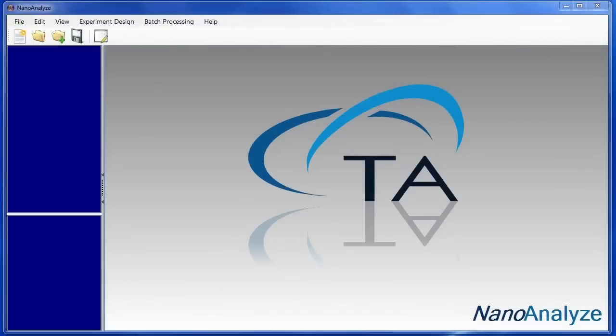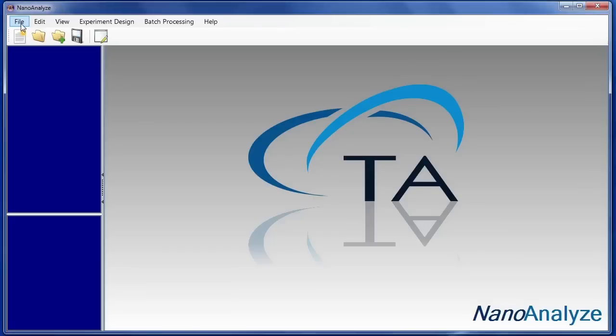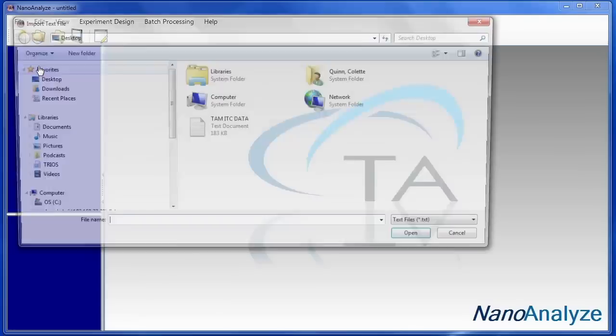After the data file has been saved as a text, NanoAnalyze can be opened. From this point, the data can be imported by clicking on File, Import Text File. And we can find the text file that we want to import and click Open.